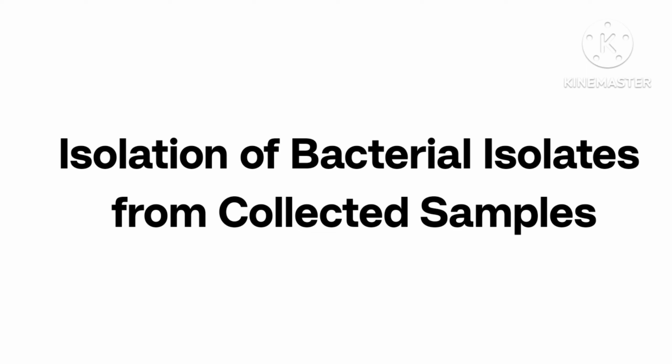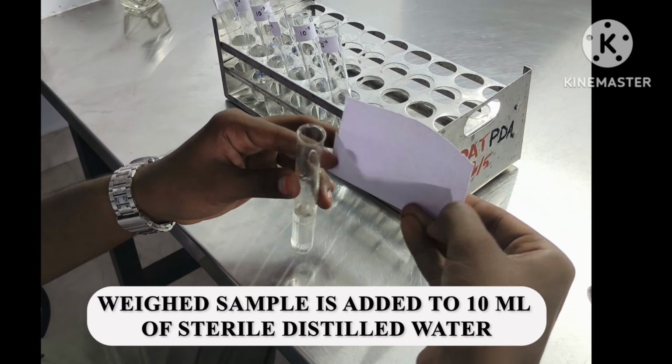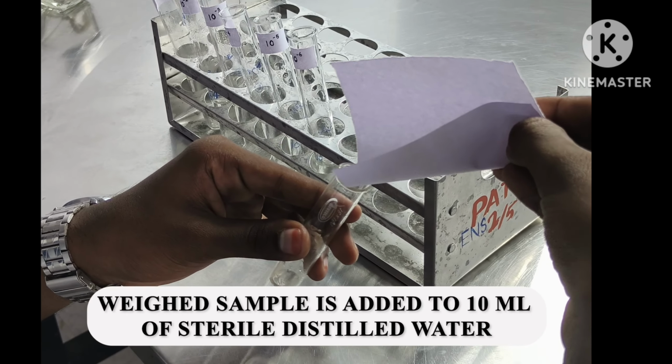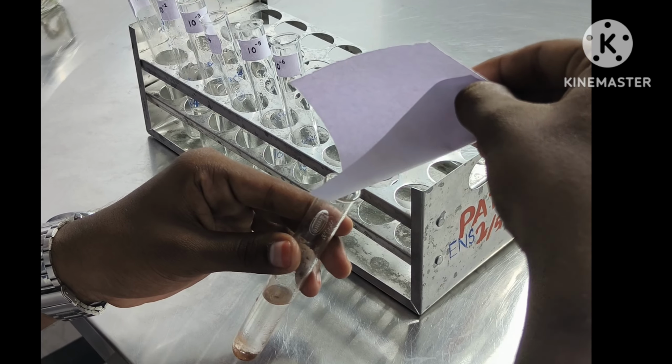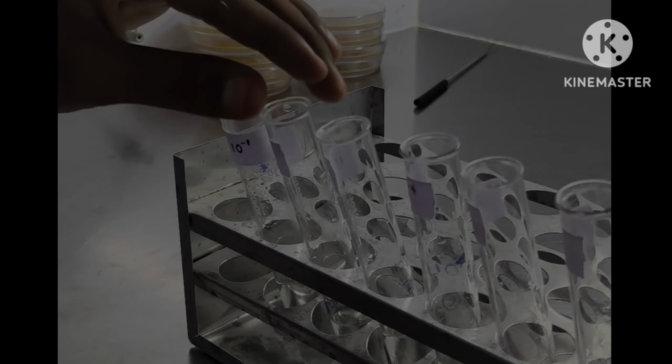Isolation of bacterial isolates from collected samples. Weigh 1 gram of soil sample. Weighed soil sample is then added to 10 ml of sterile distilled water. The test tube is then tapped gently for the microbes in the sample to get blended with the solution.